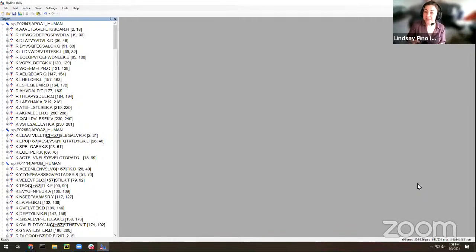So if I were to analyze this DIA data, I could try just pulling the DIA files directly in at this point. It would be a real pain in the butt if I were to do that because, as was mentioned in the Q&A, we've got hundreds of precursors, hundreds of peptides that we would be trying to manually curate out of our data with no spectral library, with no retention time information. This would be a real slog. I would not want to do this.